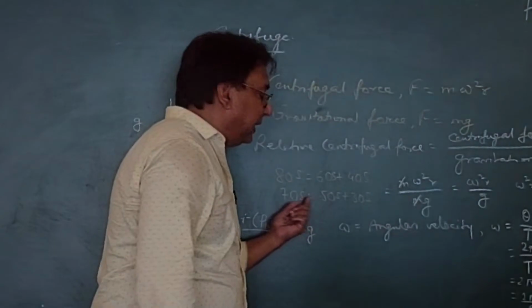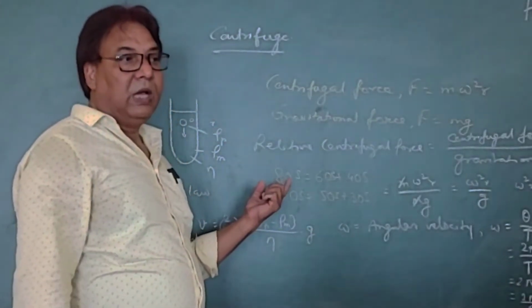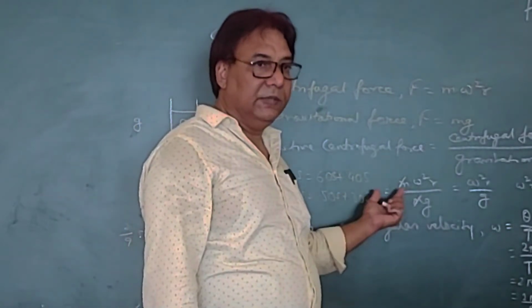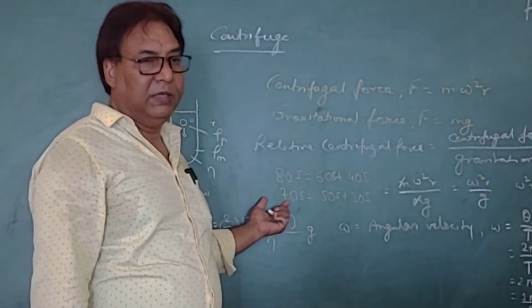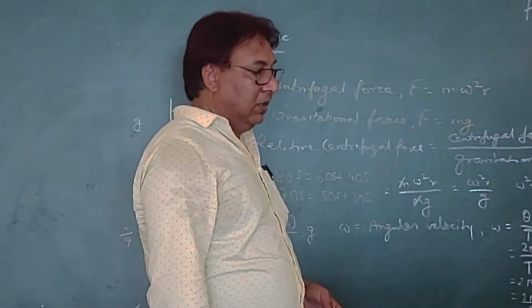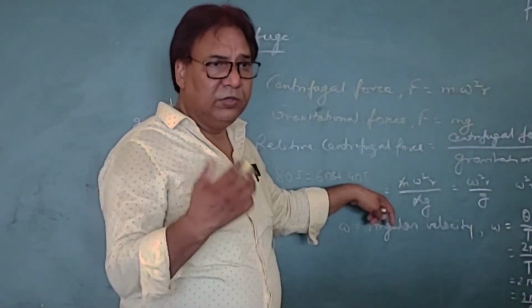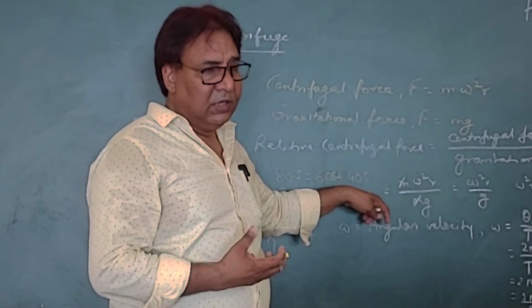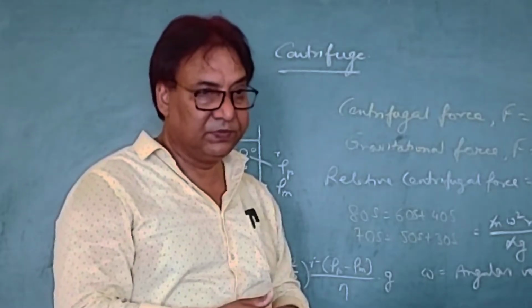Why are these two units not additive? I mean 60 and 40 is 100, but you are writing 60 and 40 is 80. Mathematically it is not correct, no? Why is it like this? Because this Svedberg unit is not the mass. It is not the weight of the substance. It is the rate at which the bodies get sedimented.